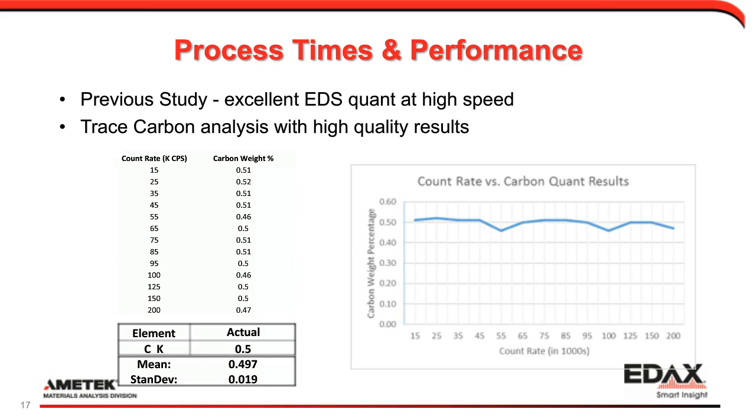But what you might also notice is that we have two different areas where we have dips in the data. So the data quality starts to veer away from the known value. And those were also certain points in the method of acquiring the data. And so in order to return the data quality to that same level before the dip, what did we do to process them?